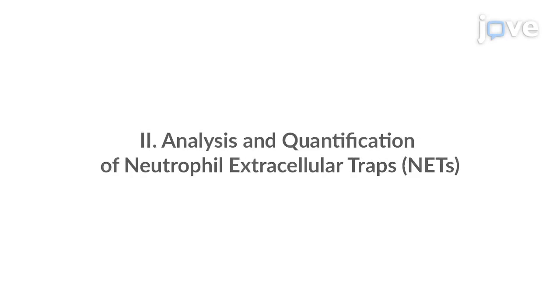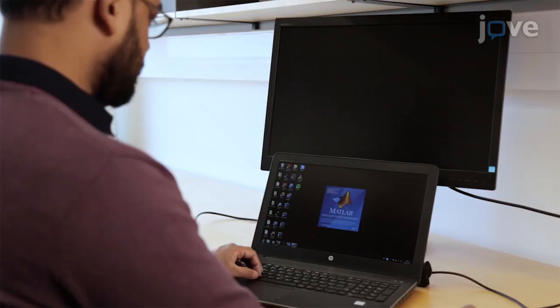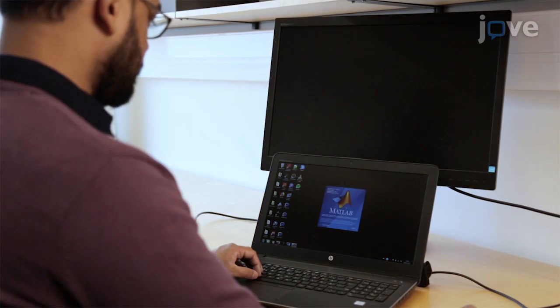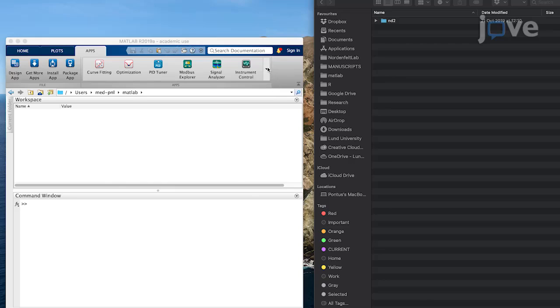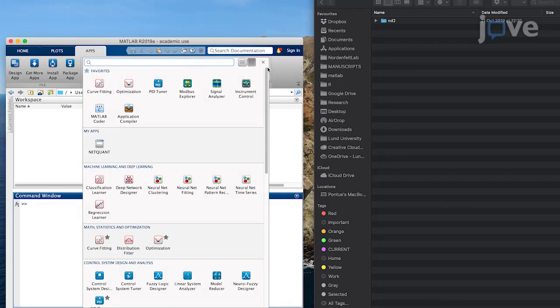Install and open the analysis software. An up-to-date version can be found on the Zenodo GitHub Archive or the Nordenfelt Lab website.